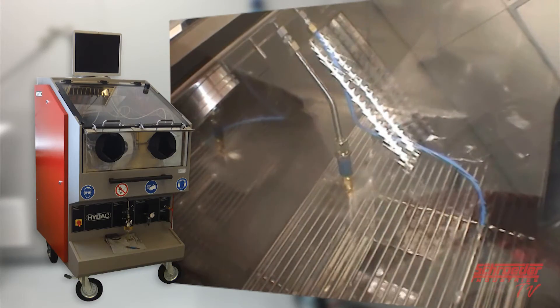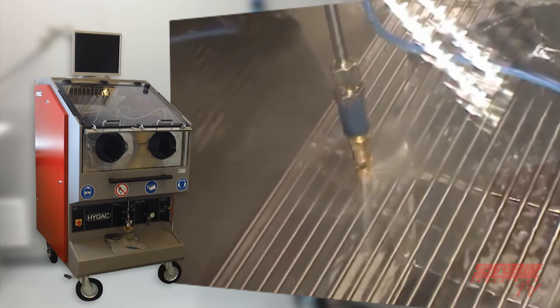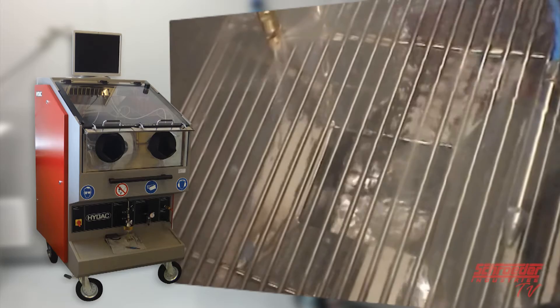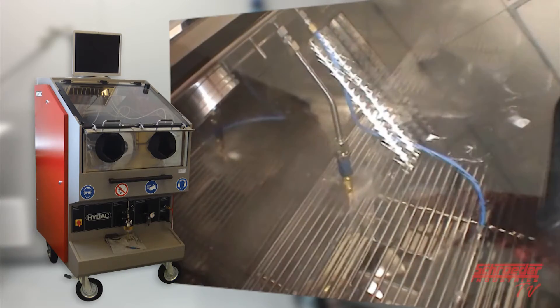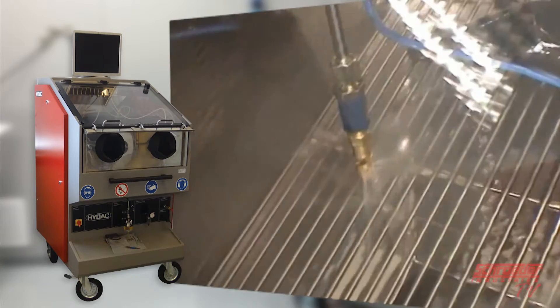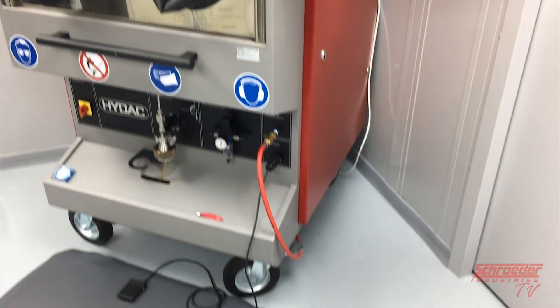Before using the CTU, the included clean box will need to be cleaned to a lower value than the blank value, which is below 0.5 milligrams in a new CTU. This process takes longer if the CTU is placed in a dirty environment, so the best installation location is in a clean room or at least a closed room with its own airflow circulation.